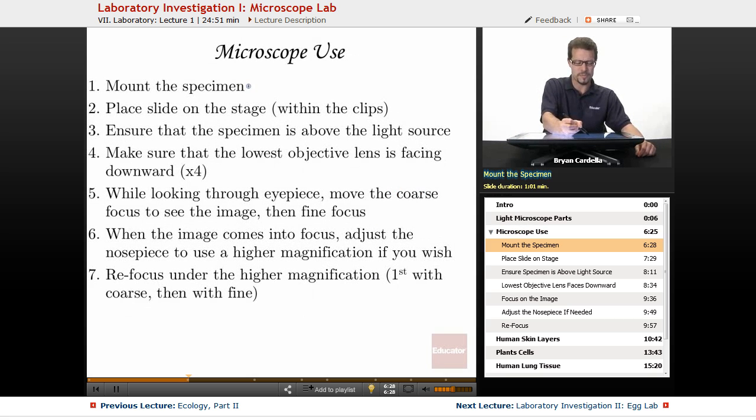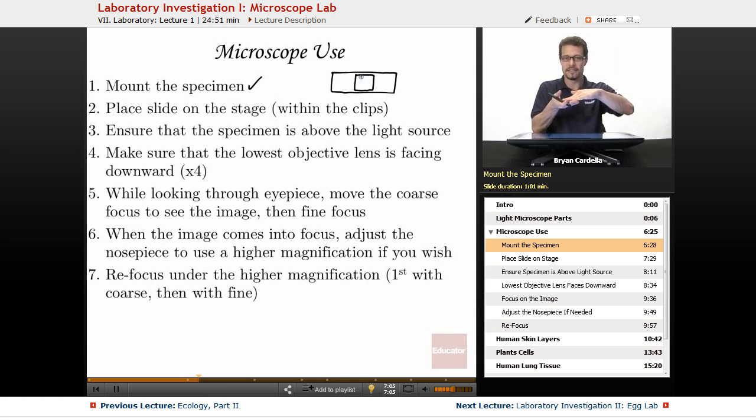Microscope use. First you've got to mount the specimen. A lot of the specimens I use in my classroom are pre-made. They're tissues that have been in the slide and preserved for years. But I also have students make their own slide. So you take that rectangular glass slide with a medicine dropper or pipette. You can take cells out of an aqueous environment. If you're doing a protist study, put a drop on the middle. Then you put a cover slip down, which is a very thin square piece. And that causes that drop to flatten the water out. So it makes it a nice, thin, aqueous environment. And the cells, if they're alive and moving, will be swimming around under there.